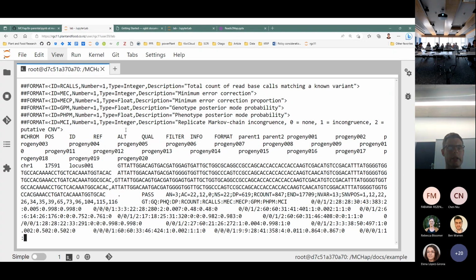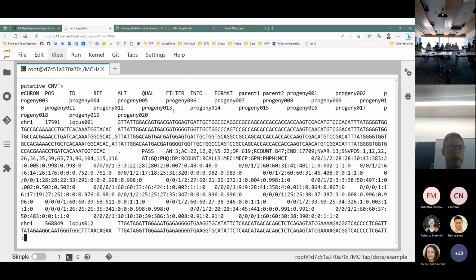So if we look here, we can see the list of all of our files. This is the order that they've come in. This should be the same order that the BAM files were entered in. Check. And then we get down to our first variant, which starts here.